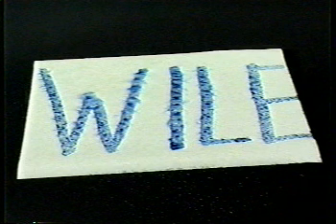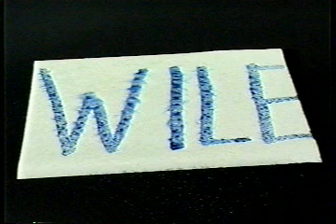So the iron that had a +2 oxidation number on the paper interacted with the iron that had a +3 oxidation number in the spray, and the result was this nice blue color, which is actually called Prussian blue. In the second half of this demonstration, then, we used two solutions, both of which contained iron. But because the oxidation numbers of the two iron compounds were different, the result, when they mixed, was pretty interesting.